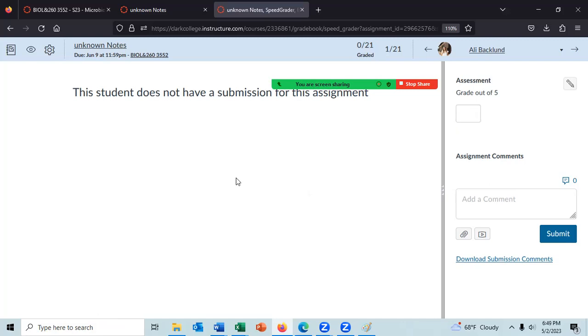And then I'll send you the test results for gelatin hydrolysis, the gram stain, and then the PR lactose. You should put your results, those are your observations. If the tube is yellow, that's your observation. You should then put your conclusion. The test was positive.